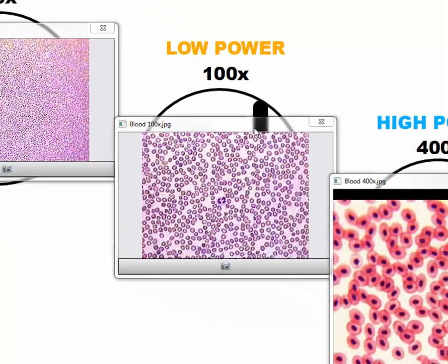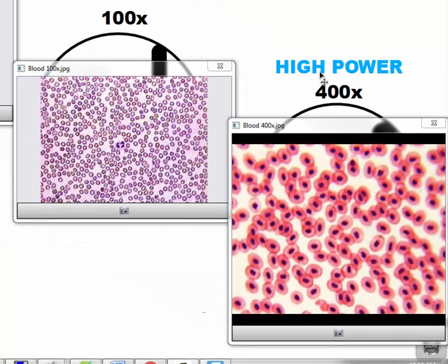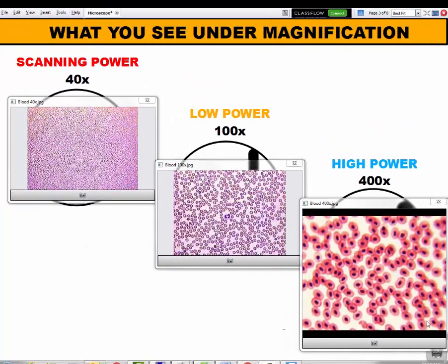Then when we switch over to high power, our high power lens gives us the biggest magnification on the microscope. So this microscope magnification is blowing up the blood cells 400 times our size. And this is going to give us our greatest detail and give us the fewest or smallest area of the field of view that we can see. So this is what magnification looks like when using the compound microscope.